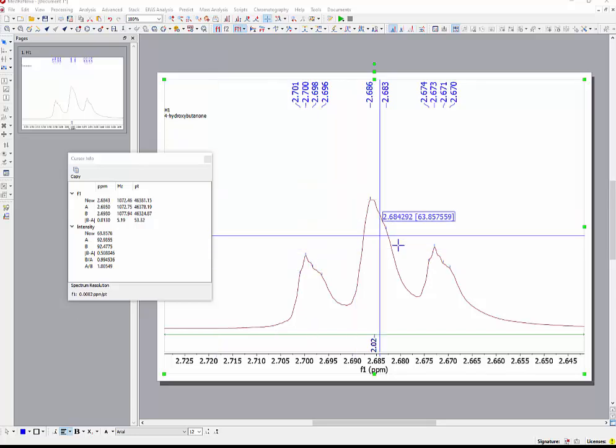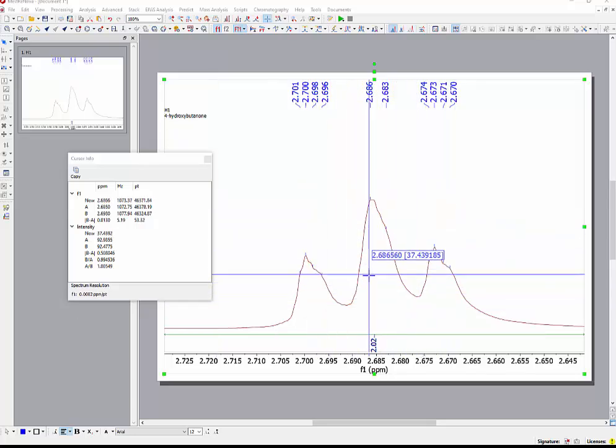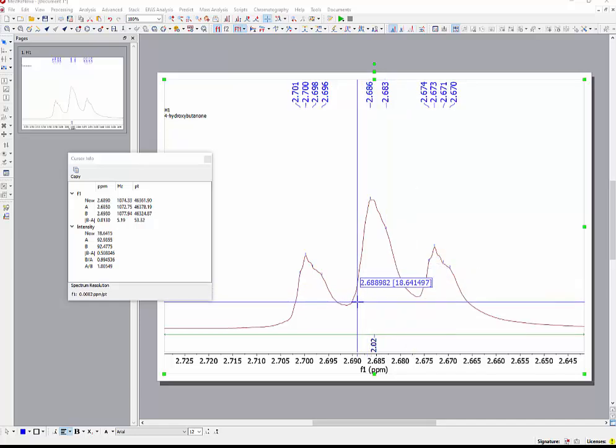More importantly, if you measure a J-value within a given peak, then it should be possible to also measure that J-value in some other peak as well. Otherwise, it's not a real J-value.